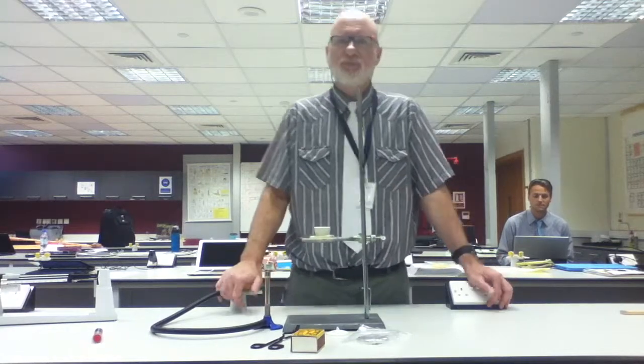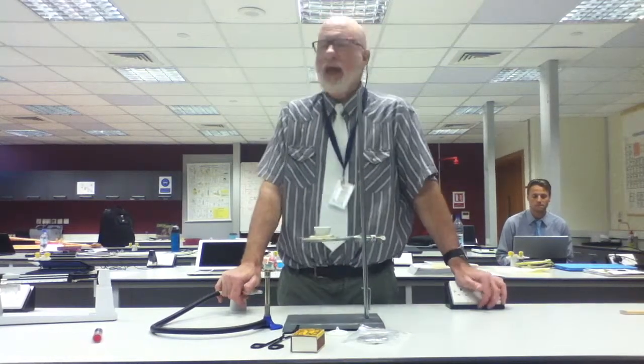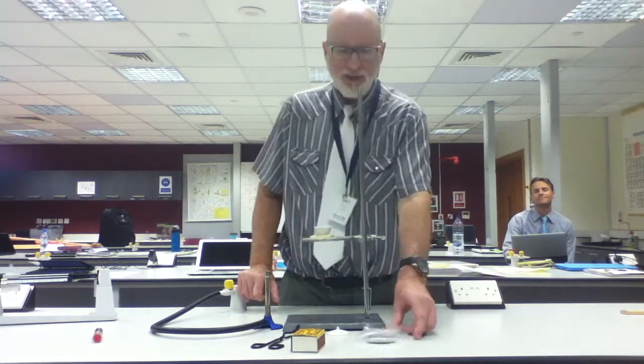Excellent. Now, this lab is going to be the production of magnesium oxide. How do you think I would produce magnesium oxide? What two chemicals do you think I would need in order to produce magnesium oxide? Anybody? Yes? Magnesium and oxygen? Magnesium and oxygen. Well, here's the magnesium.